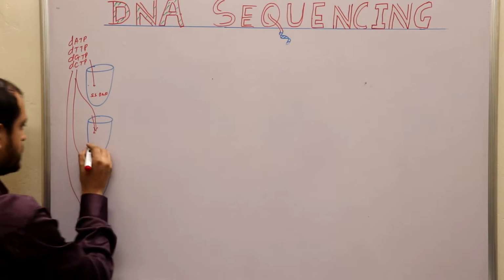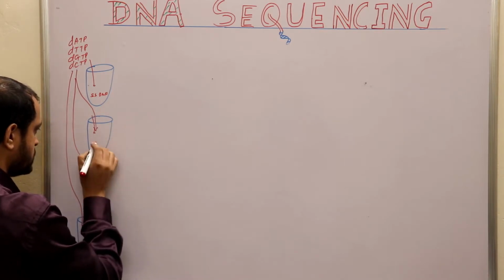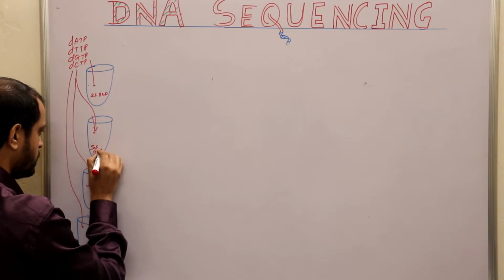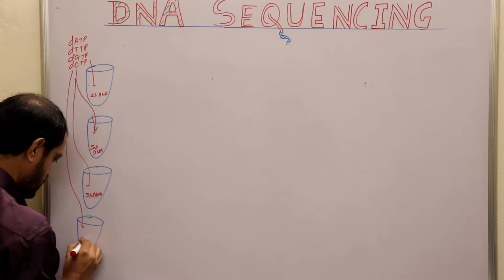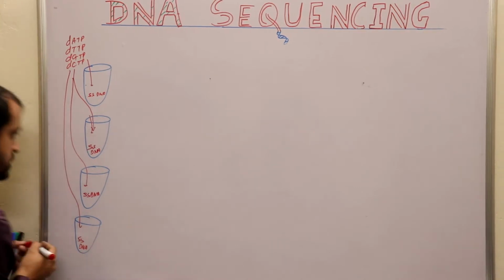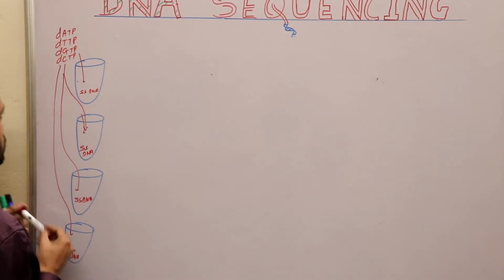Listen, every test tube contains single stranded DNA. This is DNA, this is DNA, this is DNA. Now listen with all your attention.